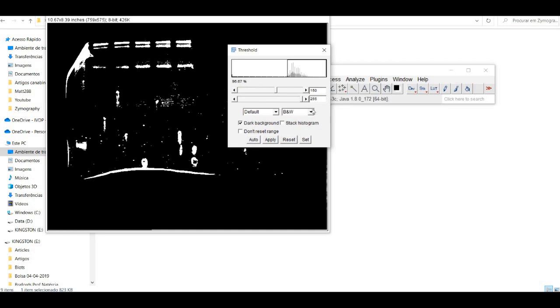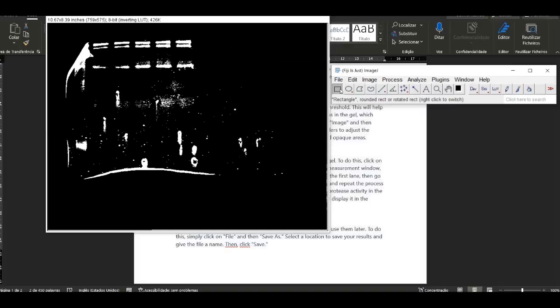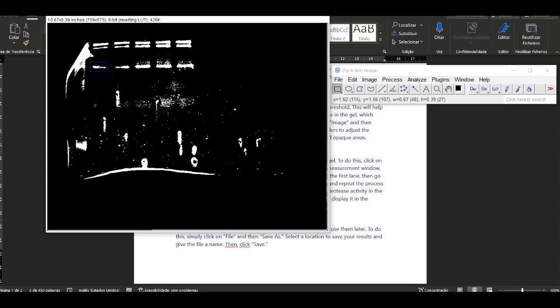The first step in analyzing your zymography gel is to adjust the threshold. This will help ImageJ distinguish between the clear areas and the opaque areas in the gel, which correspond to protease activity.